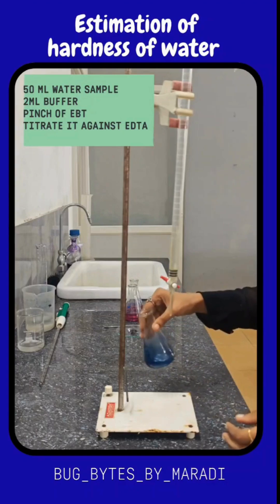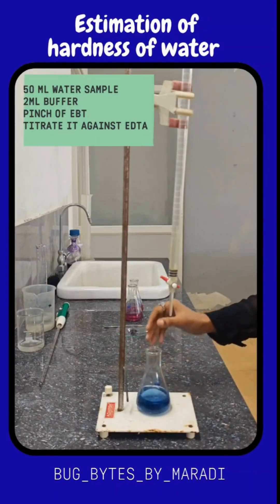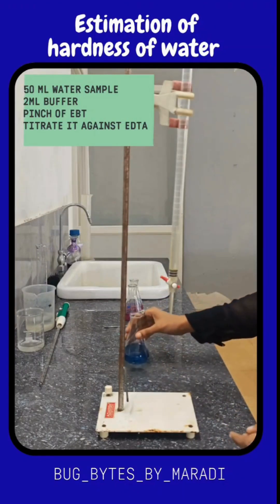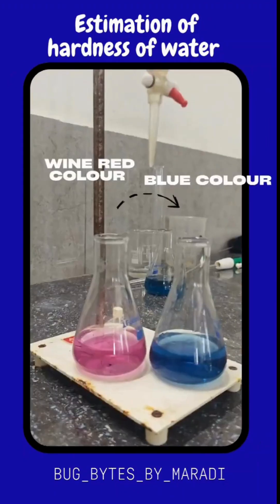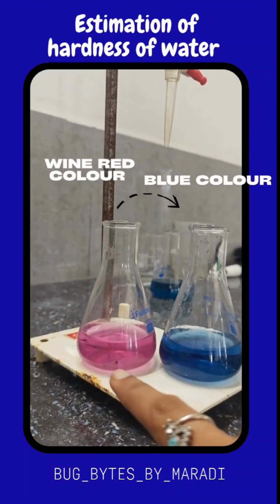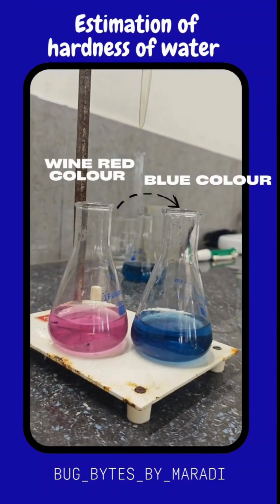That blue color will be the endpoint, and at that point you have to stop the titration. So the initial color is wine red and the endpoint color is blue.